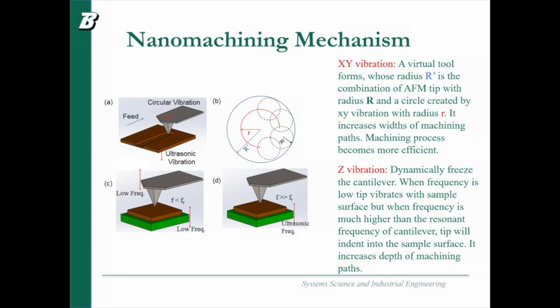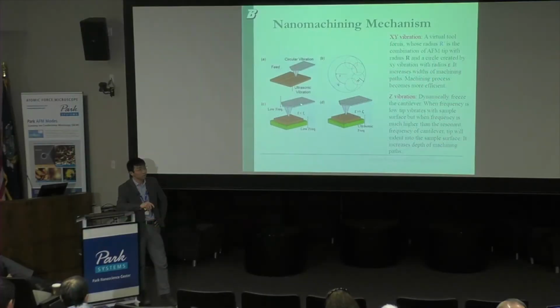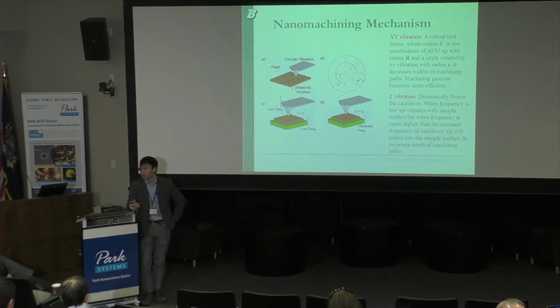That is the function of XY vibration. And in terms of the Z vibration, we have the high ultrasonic vibration, the piezo, because the tip itself has a very high vibration frequency. It is usually 160 kHz. So that's very, very high.